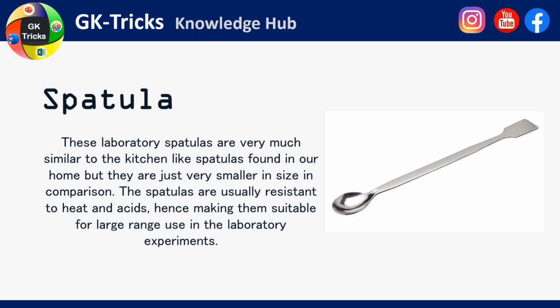Spatula. These laboratory spatulas are very similar to the kitchen spatulas found in our homes, but they are just very much smaller in size in comparison. The spatulas are usually resistant to heat and acids, hence making them suitable for wide use in laboratory experiments.